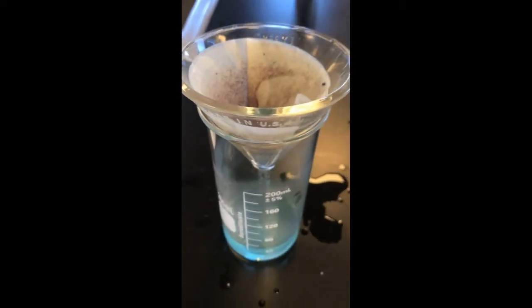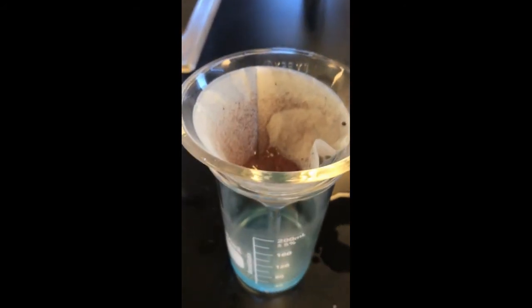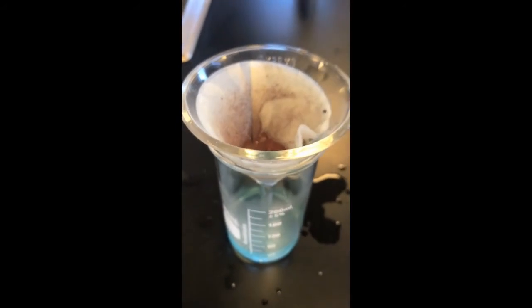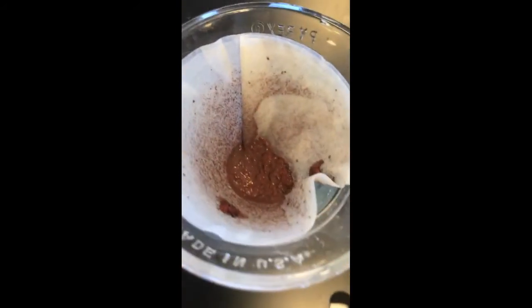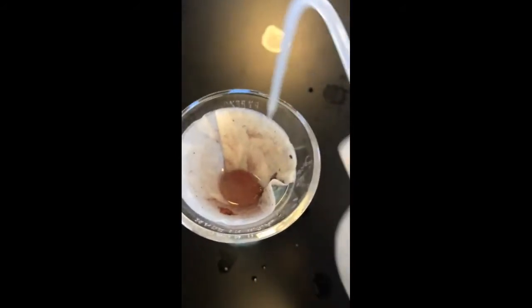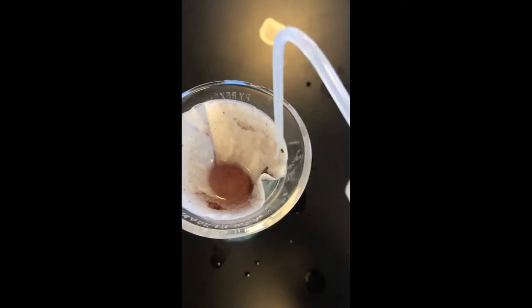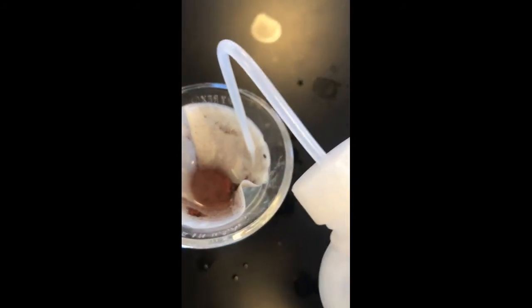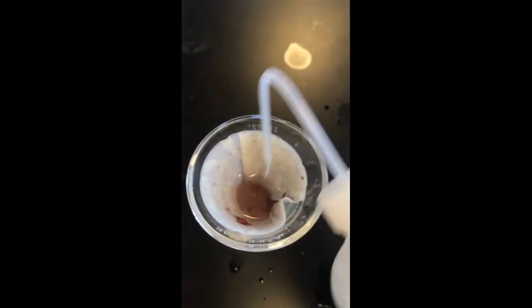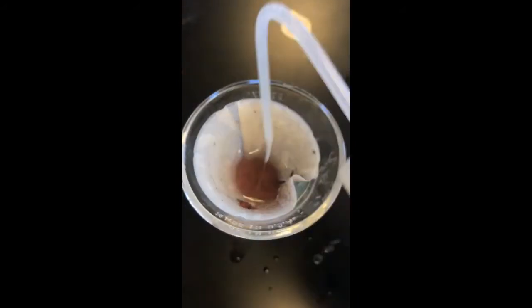All right, so now it has finally filtered out the liquid solution. So what we are left with is a lot of this stuff right here. We have to go through this process of a series of washings to aggregate all of that product that I collected and try to get it into the middle.